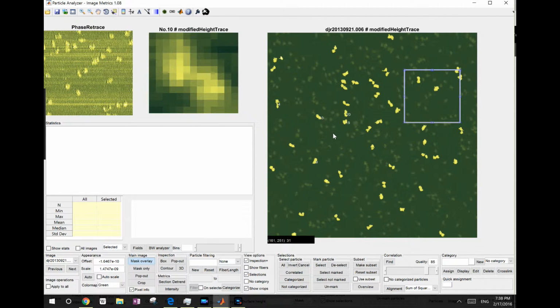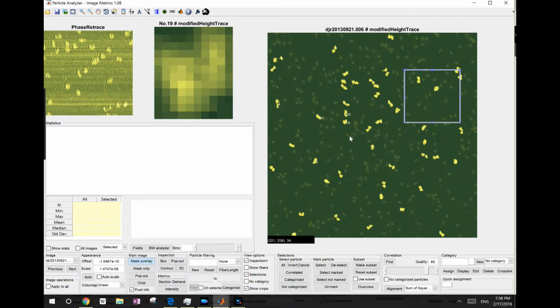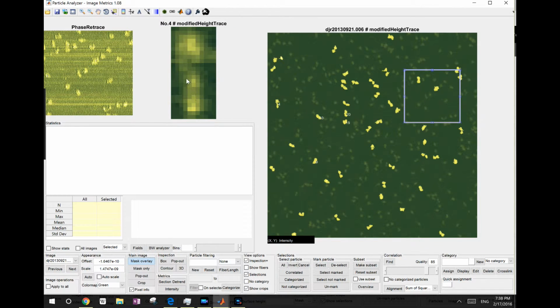But if you click the numbers, but not the particle itself, you don't actually deselect them. This is pretty useful if you just want to see them and you don't want to deselect them. You just click the particle labels, and you can blow them up and see them, but you don't do any selection or deselection operations.